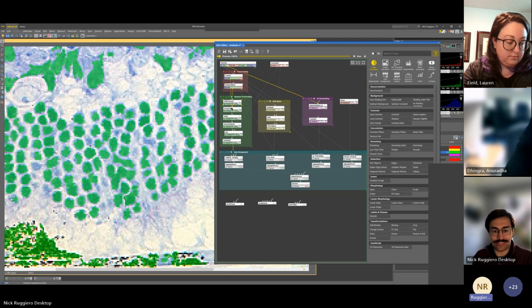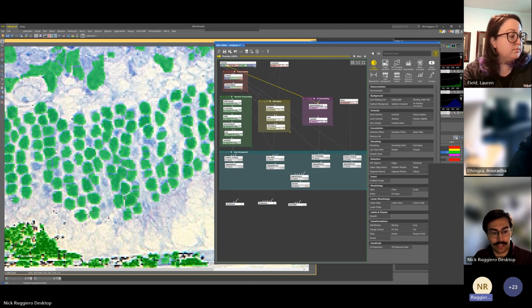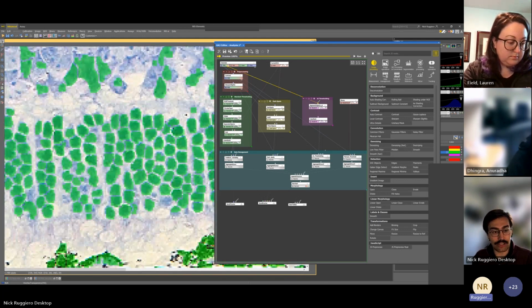And from there, you can see I have a lot of the things that we've been talking about. I have an open function that I used. I tried to dilate them a little bit. I tried an erosion here because I thought that would help sort of segment them out from each other, but I ended up just getting really awful counts. So I kept the dilation in here and I ran a separate objects. And that does a pretty good job, actually.